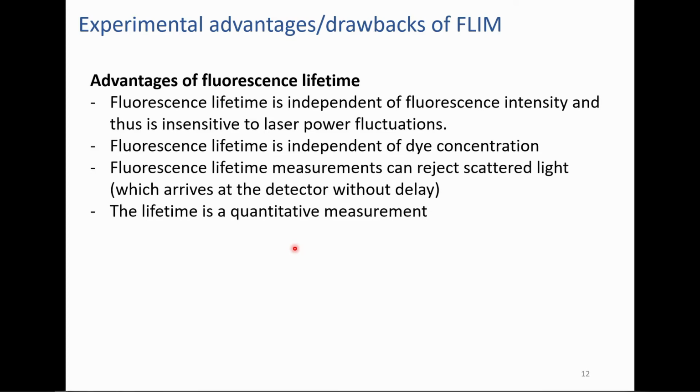The lifetime is also independent of concentrations, so it doesn't matter whether the initial population N2 is very high or very low, because all you're measuring is the decay rate, and the rate of decay doesn't change with concentration.